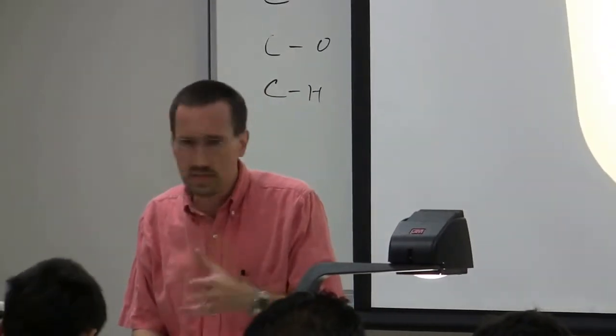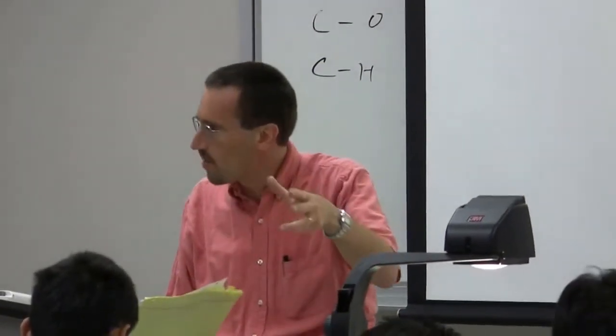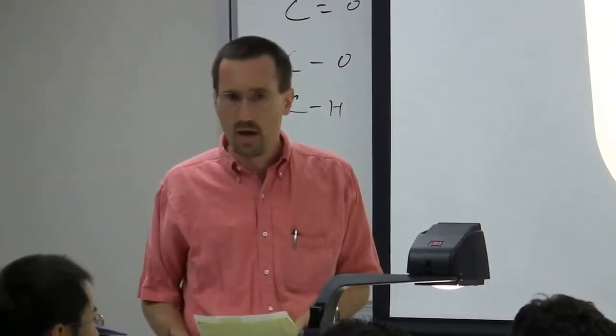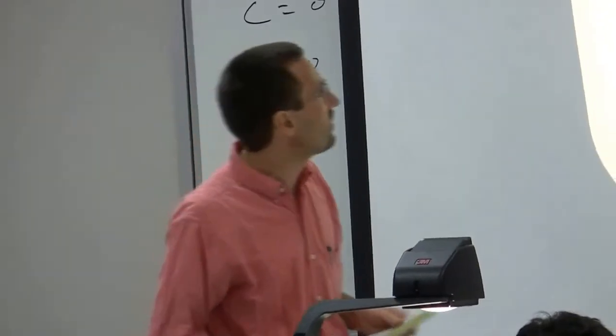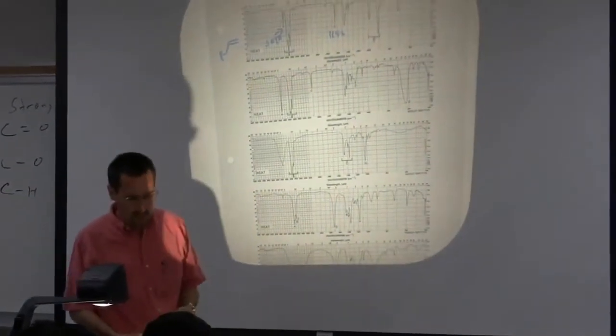But the molecules that we study have gotten bigger and more complex, and people, for pedagogical purposes, still tend to look at small molecule examples. This is a small alkene, maybe octene or something. But as you get to larger and more multifunctional molecules, this region gets harder to read.